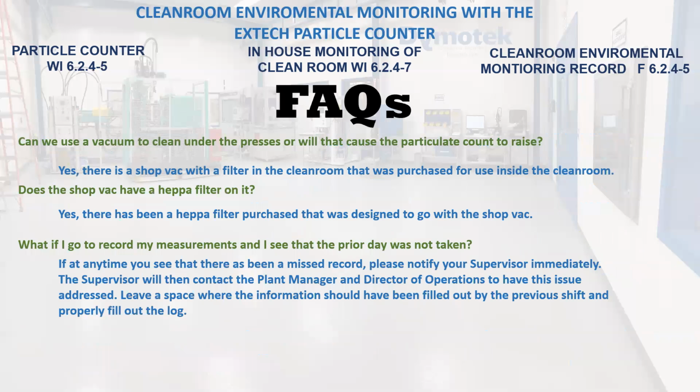Some frequently asked questions. Can we use a vacuum to clean under the presses, or will that cause the particulate count to rise? Yes, there is a shop vac with a filter in the clean room that was purchased for use inside the clean room. Does the shop vac have a HEPA filter on it? Yes, a HEPA filter was purchased that was designed to go with the shop vac.